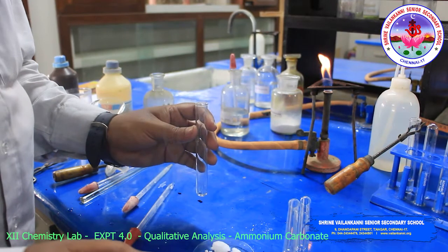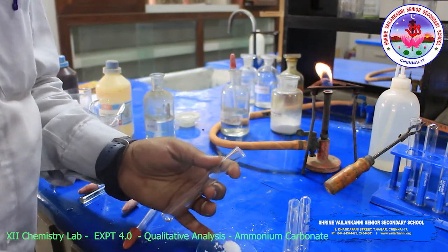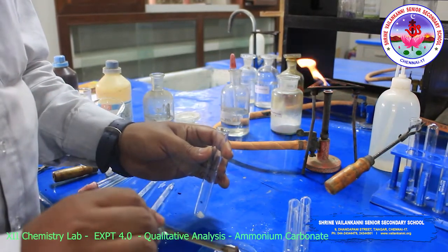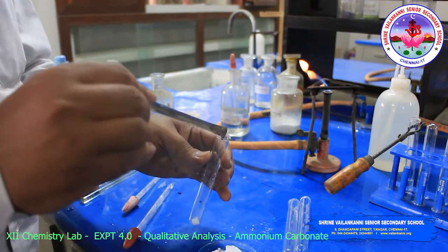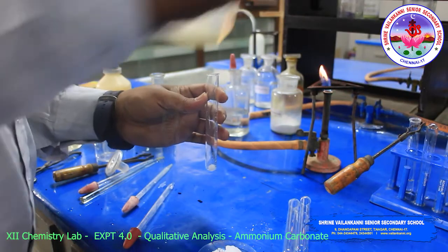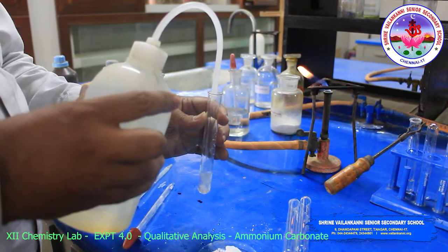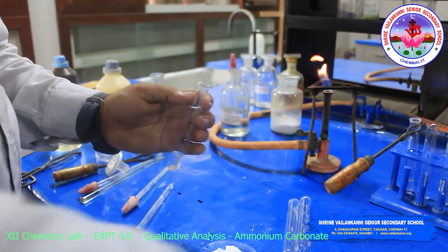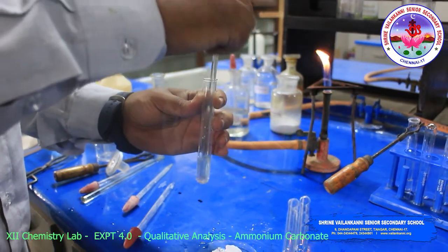Now we will do the tests for the basic radical. Prepare the original solution: take a small amount of the substance and prepare the original solution. With the help of a glass rod, dissolve the substance.